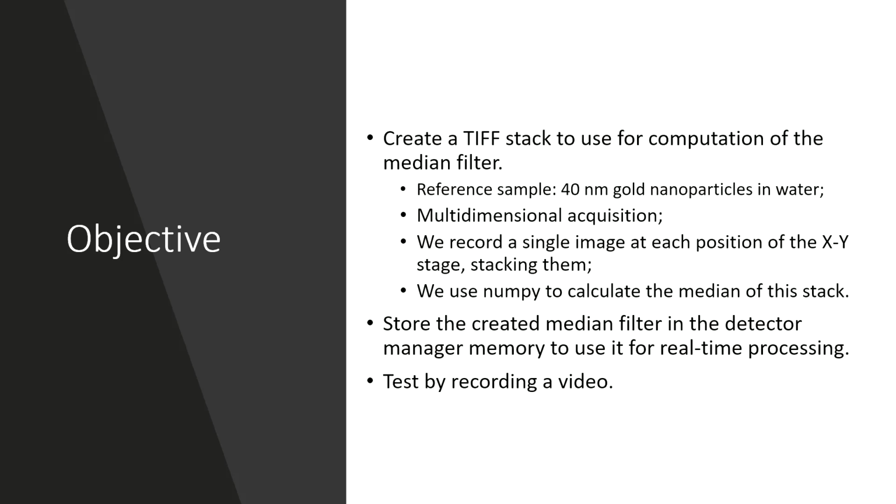Then we will use NumPy to calculate the median of this stack, and this will be used as our median filter to apply to our recordings. So we have to store the created filter in the detector manager and use it for real-time processing. And we will show how this works by making a test record.